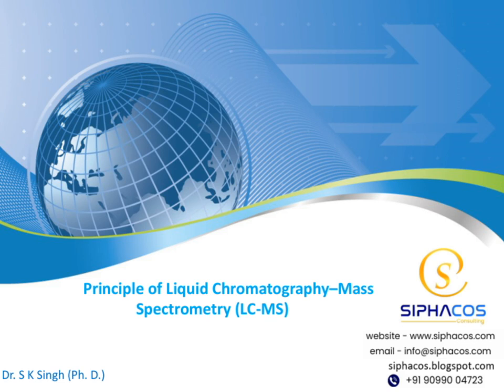Today, we'll be exploring the principles of liquid chromatography, mass spectrometry, or LC-MS for short. Over the course of this presentation, we'll cover the fundamental concepts, how this technique works, and its applications in various scientific areas. So, let's get started and dive into the world of LC-MS.